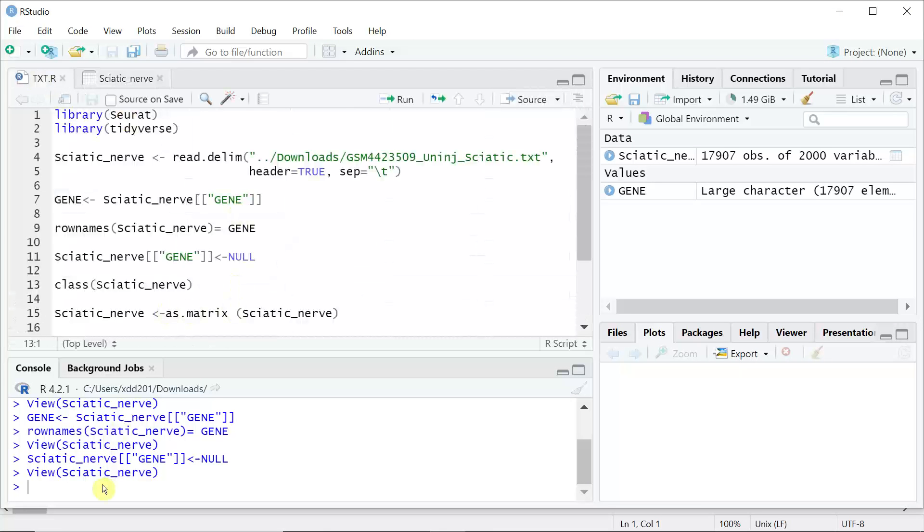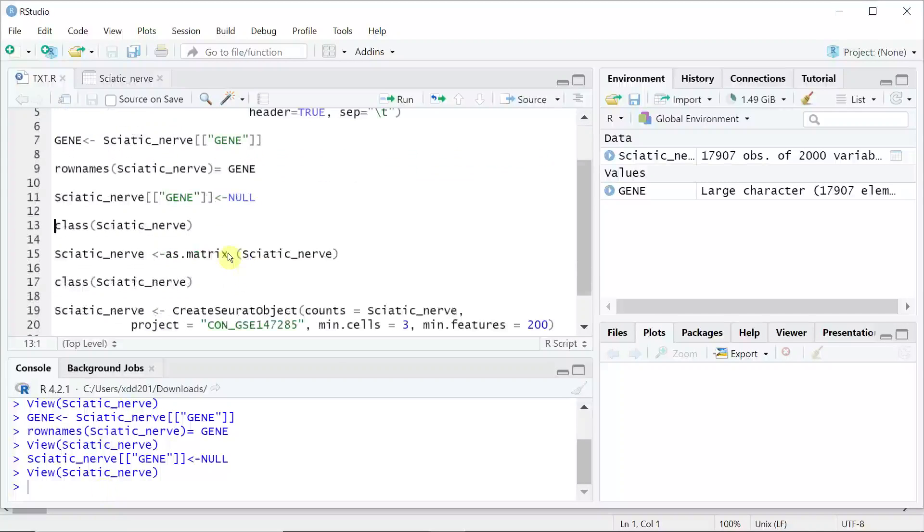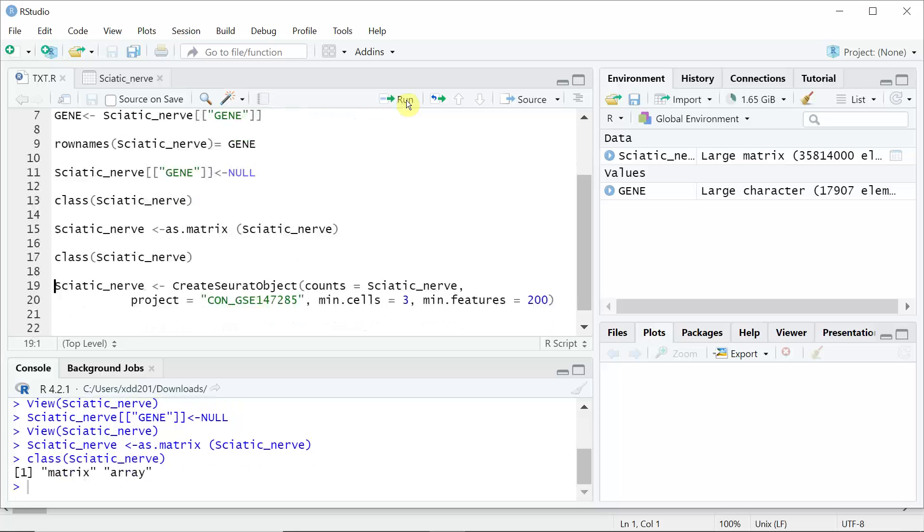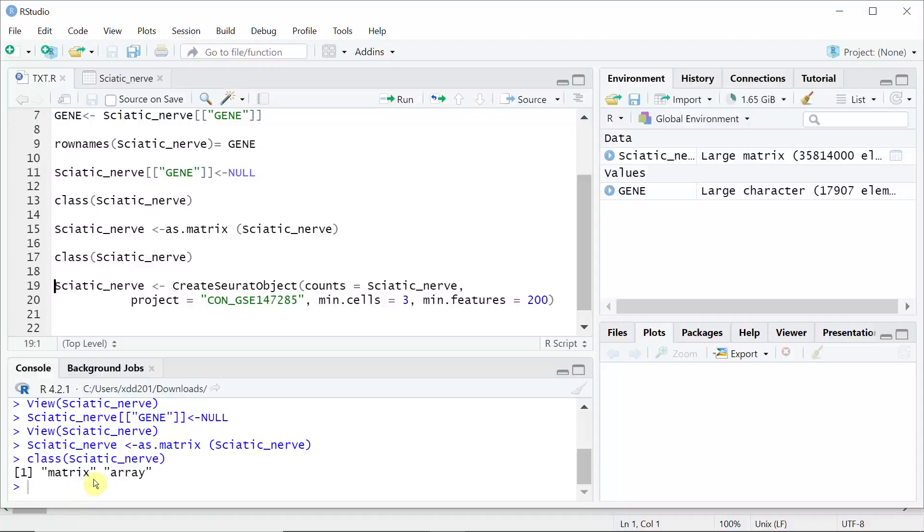At the moment it's a data frame. We can use the function as.matrix to change the property of the data frame. If we run this function and have a look at the class sciatic_nerve again, you can see now it is a matrix.